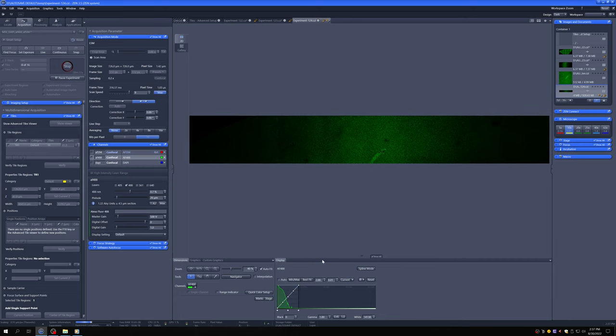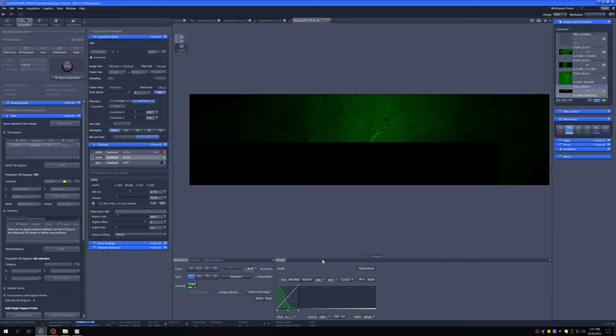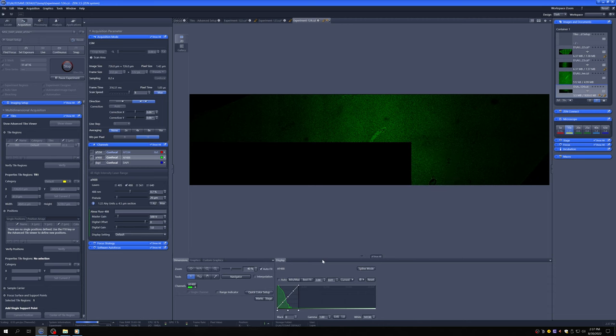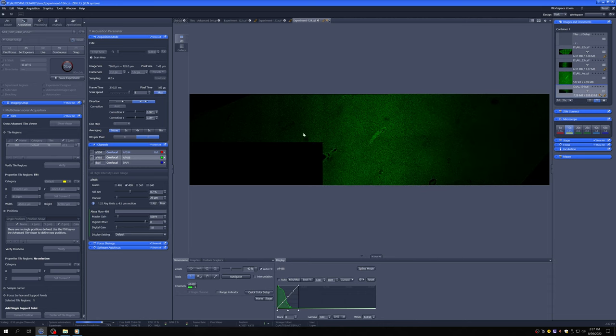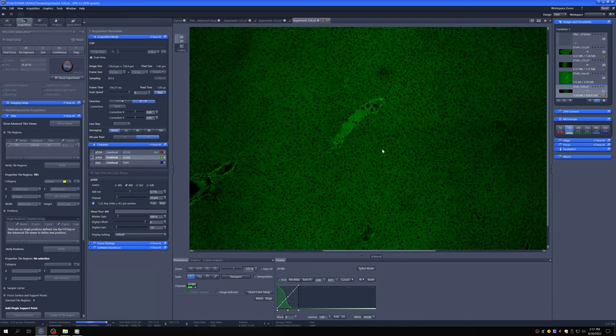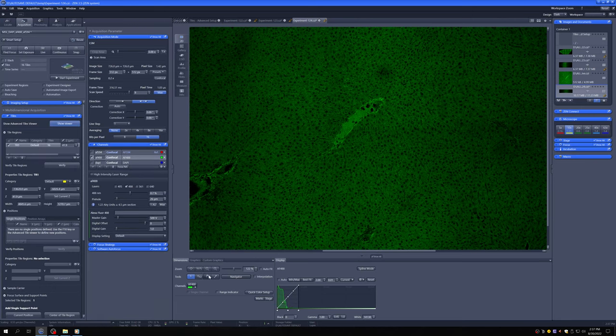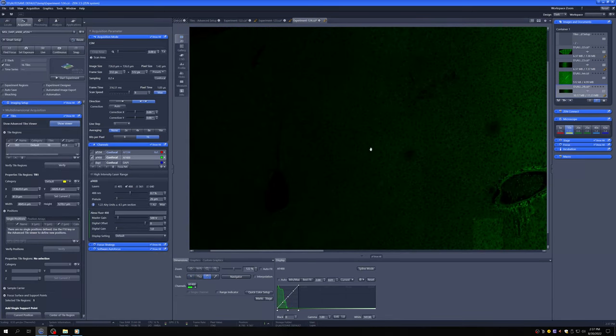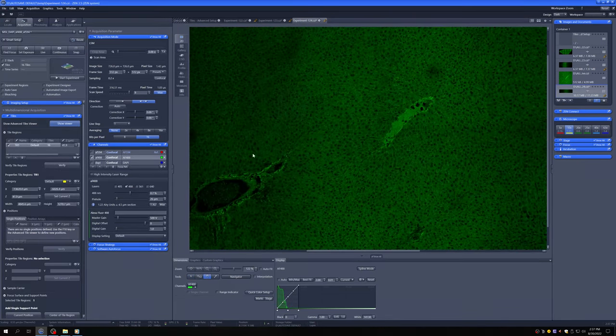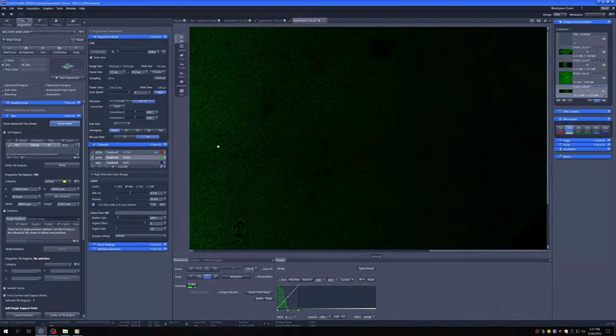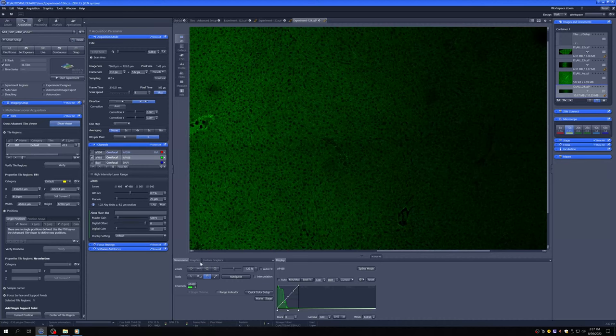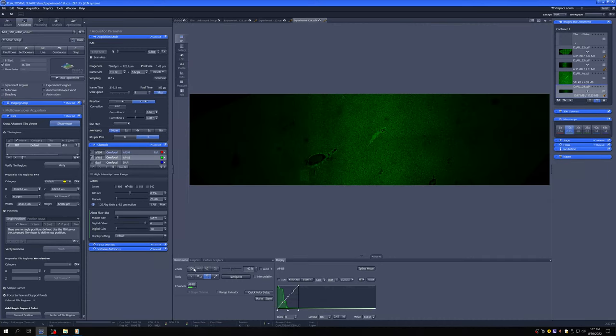I tilted it on purpose, but often you'll see that this will happen to you not on purpose, and so you need a solution. So this is not good. The middle is nicely in the focal plane, but as you go to the edges, there's obviously a tilt problem. So what can we do about that?